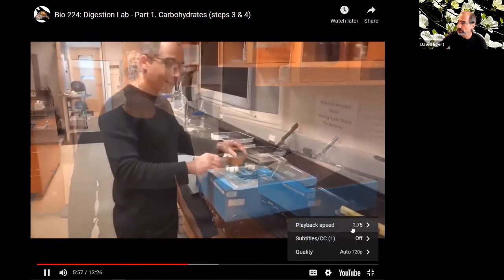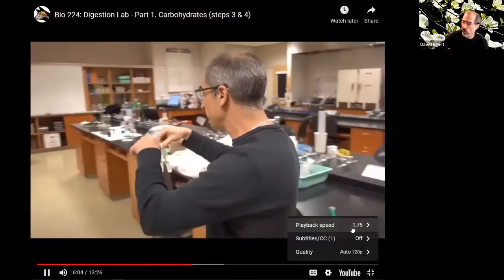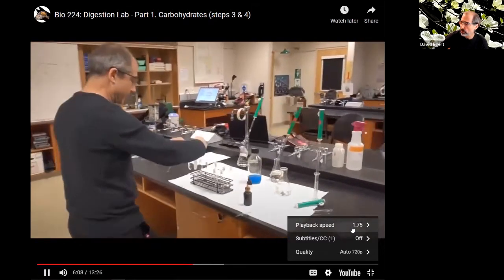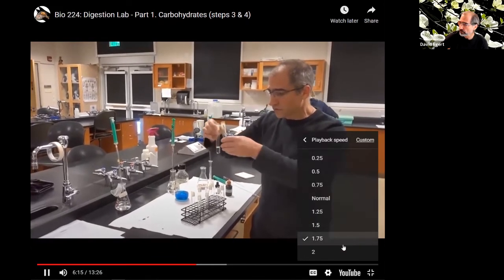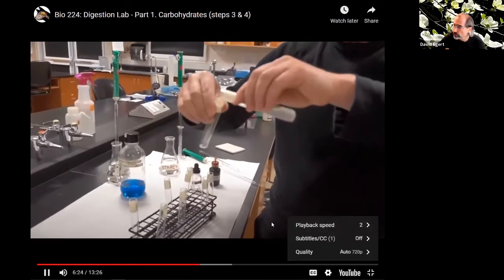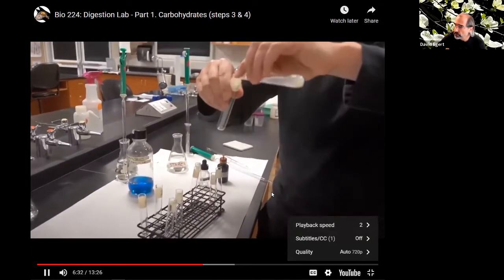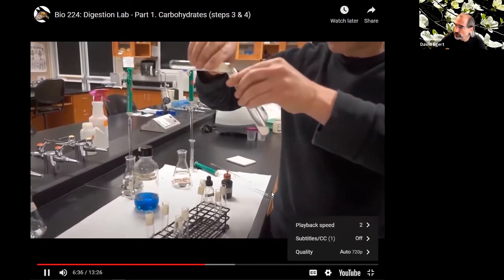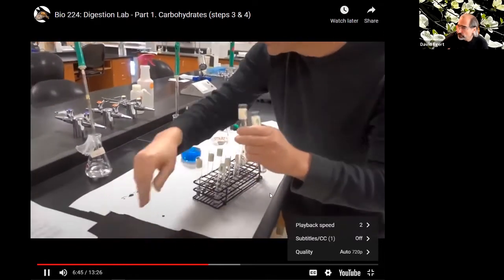All right, so these have been incubating at 37 degrees C, and now we can do our assay and see what the results are. Each of these needs to be split into 2 roughly equal test tubes so we can check each sample both for maltose as well as for starch. It doesn't matter exactly, they'll just be roughly equal. These are my 3 experimental tubes here. And then remember, I also have the control tubes here. This is just pure starch from before.